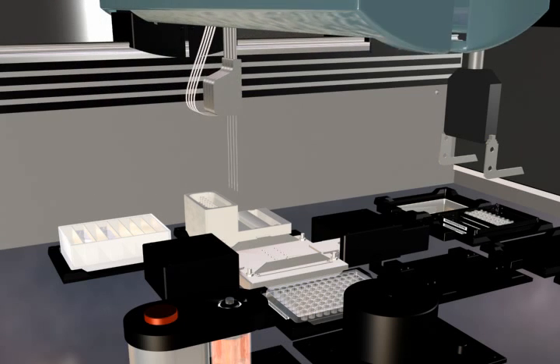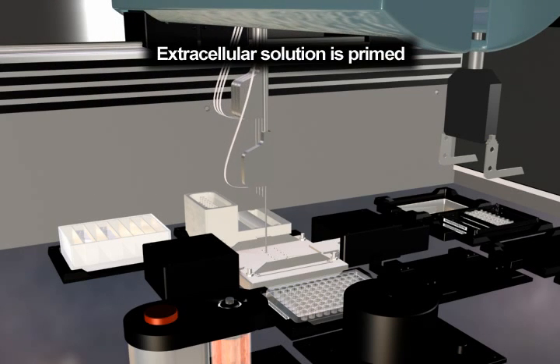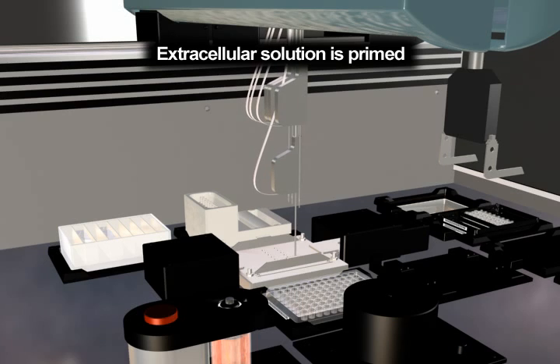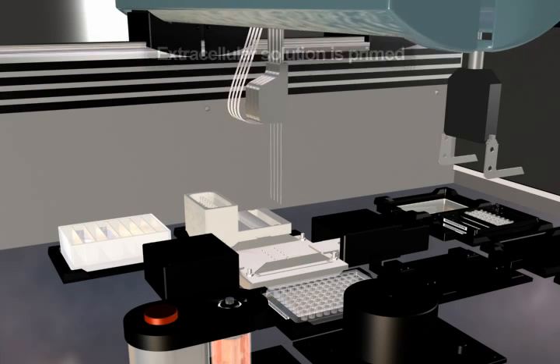Extracellular solution is added to each inlet well, and electrode resistance of about 2 megaohms are measured on all 16 channels.